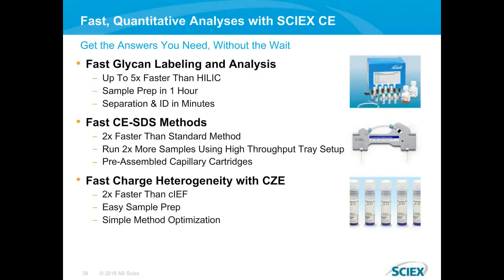So there may be some optimization necessary, or there may be other methods which are going to be better specifically for that species. The assay described here was specific for cleaving N-linked oligosaccharides from the peptide backbone of the antibody using the enzymatic digestion technique, and then labeling those sugars. So there may be some optimization that can be performed in this situation, but without more information, it'd be very difficult to confirm that here in this setting.